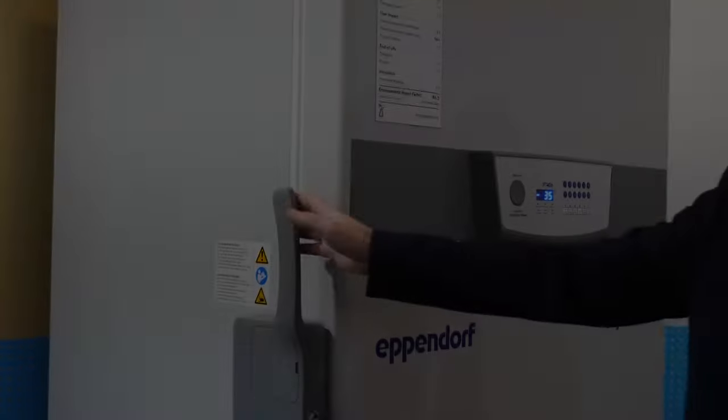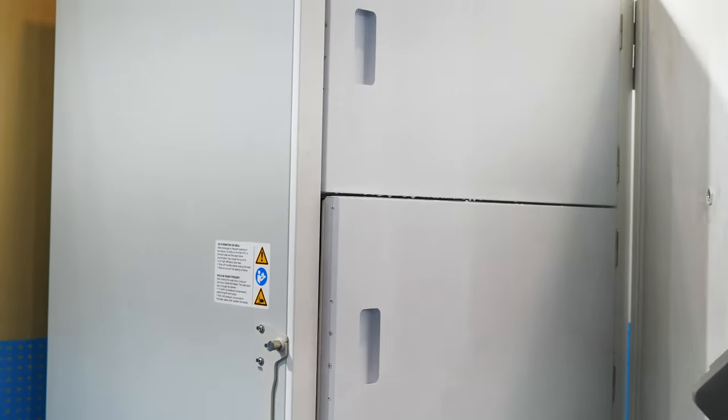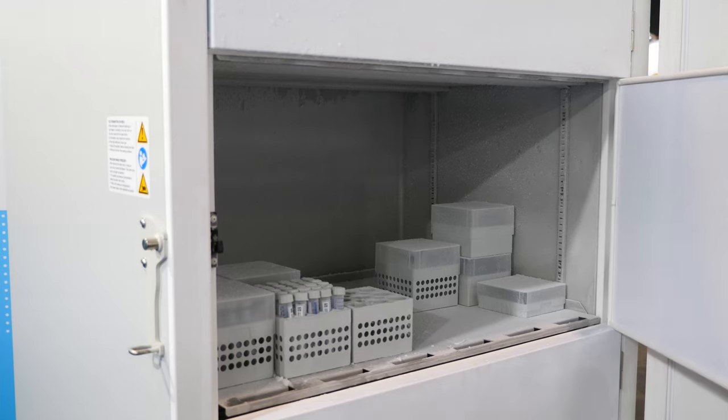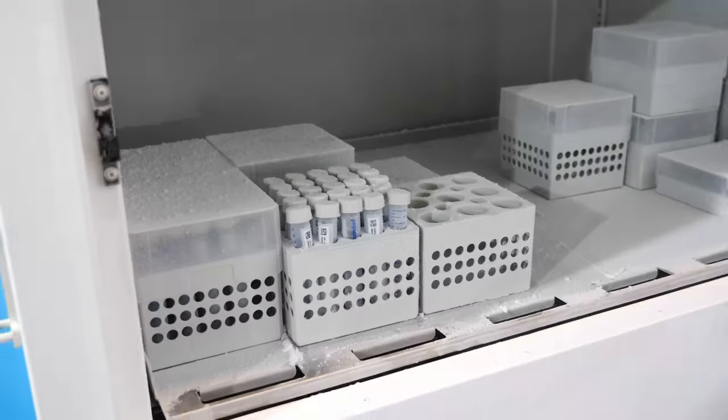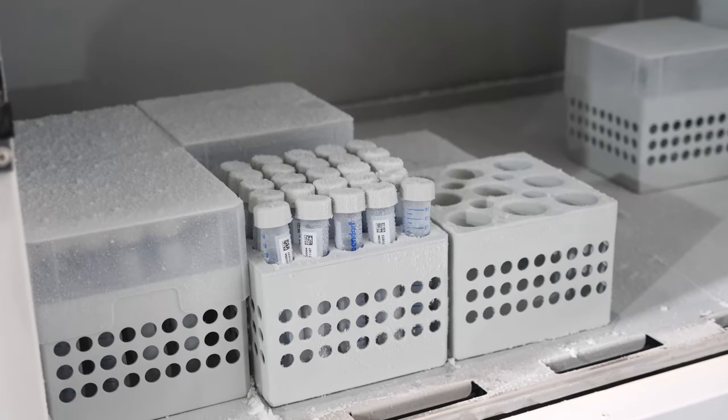The inside of the freezer is stainless steel, so it's easy to clean. The outer vent port in the outer door enables you to have fast and quick re-access to your samples if you need to bring in more samples right away. The outer door can be selected with a left or right door handle, depending on your needs in the lab.